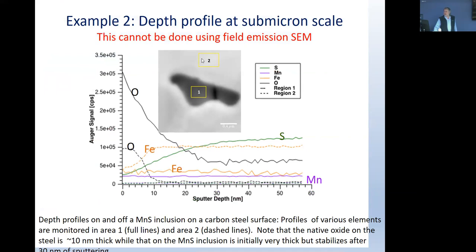So let's look at the depth profile of iron, typical iron surface. You can see apparently there was 10 or 9 nanometer of oxide. This is a native oxide. It's not surprising on the surface of this ferrite structure. And then nothing else. There's no manganese and sulfur here, obviously. And then iron increased, and now this is pure iron steady state.